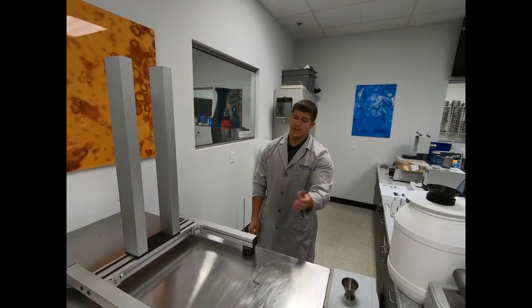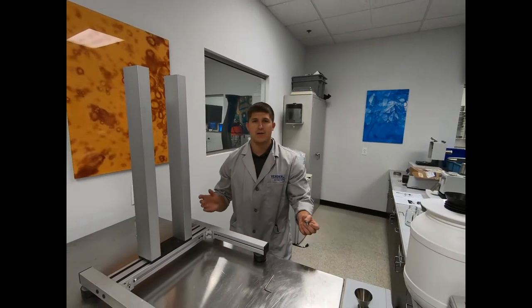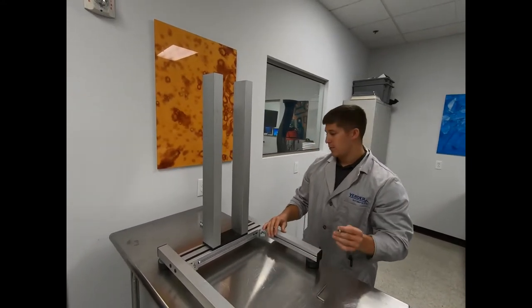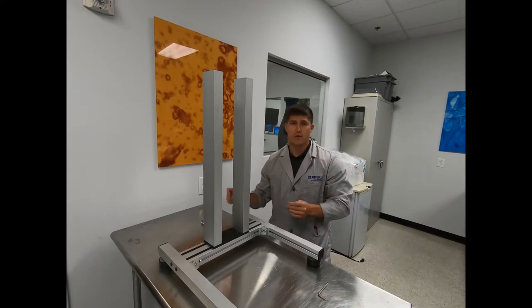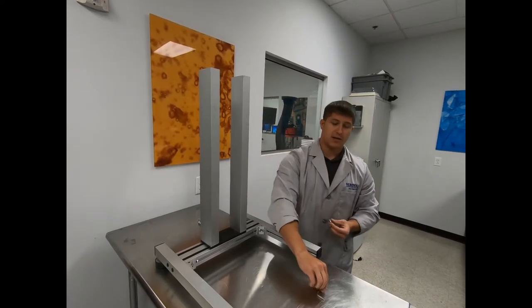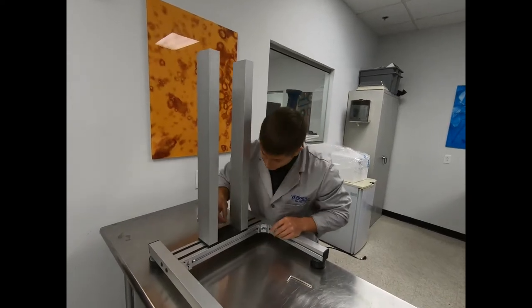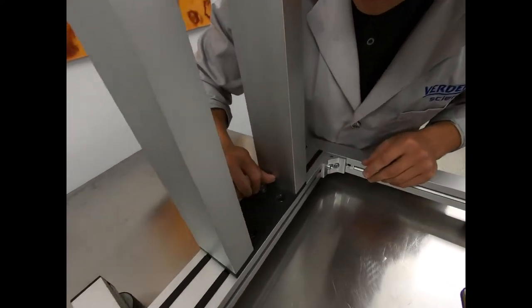The first step to configuring your brand new PT200 sample divider is to install the stand onto the base frame. What you're going to need for this is four complementary bolts and your allen key. Screw them into the four corresponding holes right at the bottom of the base frame.